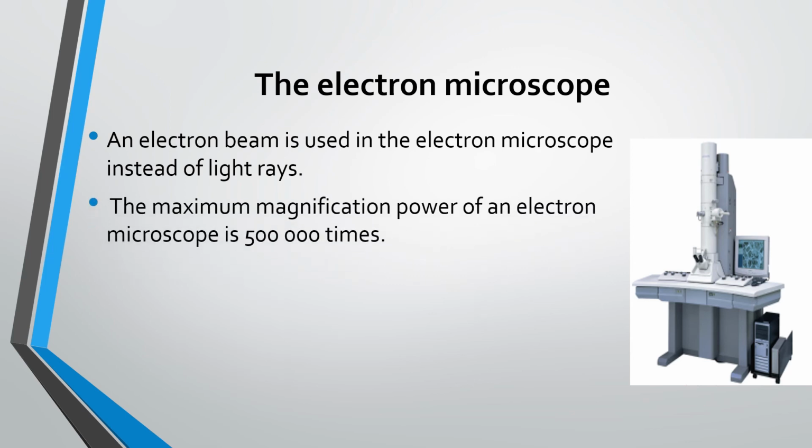And also the maximum magnification power of an electron microscope is 500,000 times.